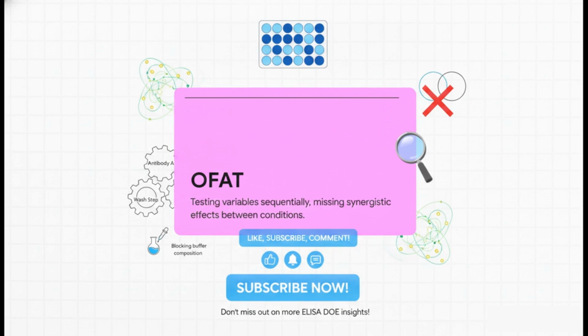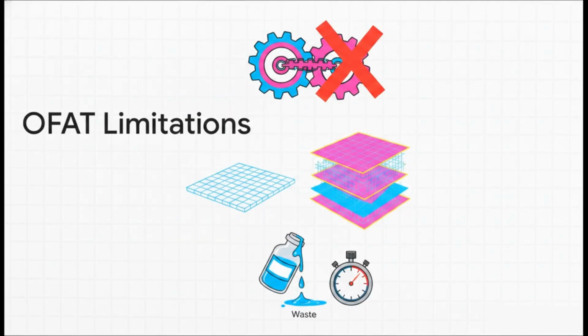Even though you are technically testing two variables, you find those optimal antibody concentrations on the plate, and then you lock them in. After that, you move on to test other factors, like your blocking buffer composition or your wash steps, completely in isolation. By locking in those antibody concentrations so early in the game, you totally miss the critical synergistic effects between all these different assay conditions. And this is a major problem, because biological systems are incredibly interactive. Doing things this way completely fails to efficiently model those interactions. It's like you're only getting a flat 2D slice of a highly complex 3D system.